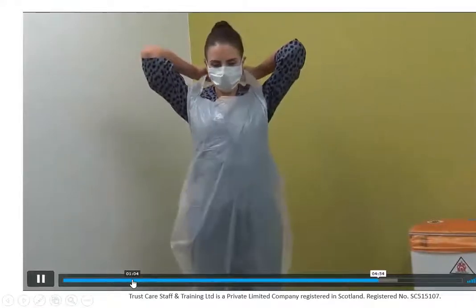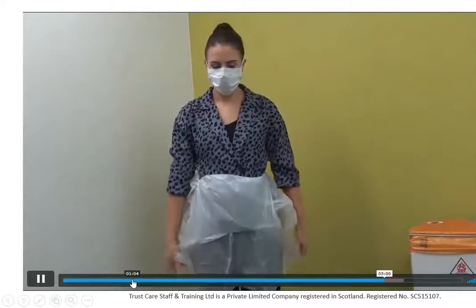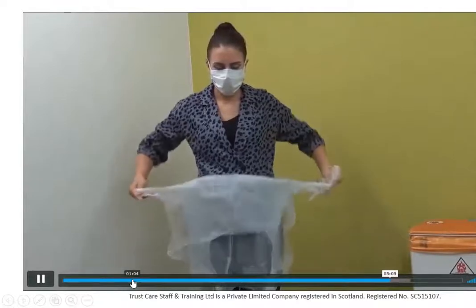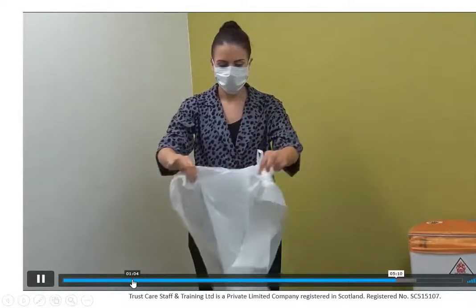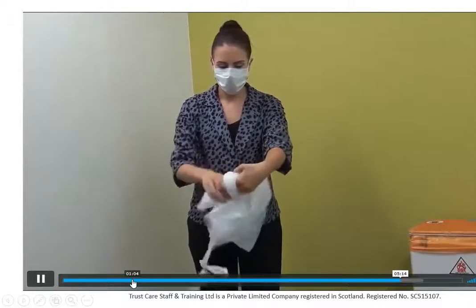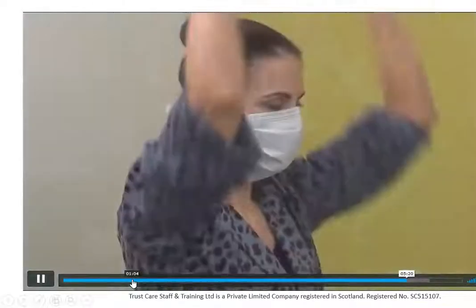You take the apron off next — break it at the neck first. Think of it as a contaminated piece of equipment. Fold it down so you're not touching the outside of it, then take it from the waist and pull it forward. Do not touch the outside of the apron; do everything from the inside. Discard it as healthcare waste.